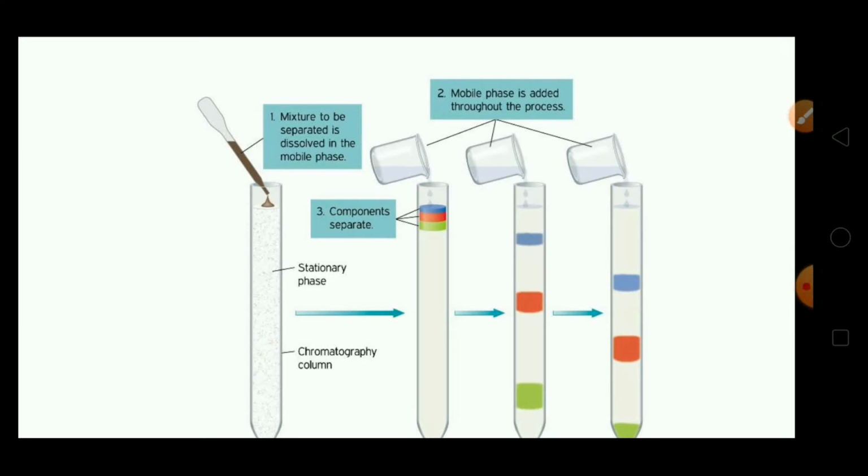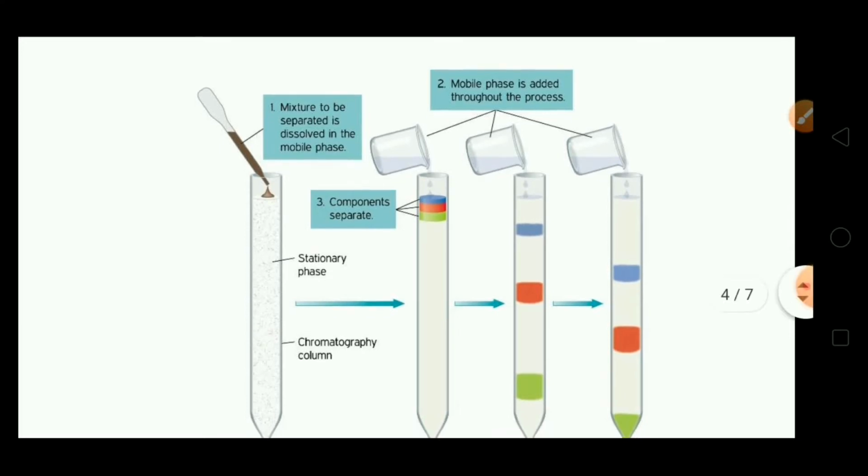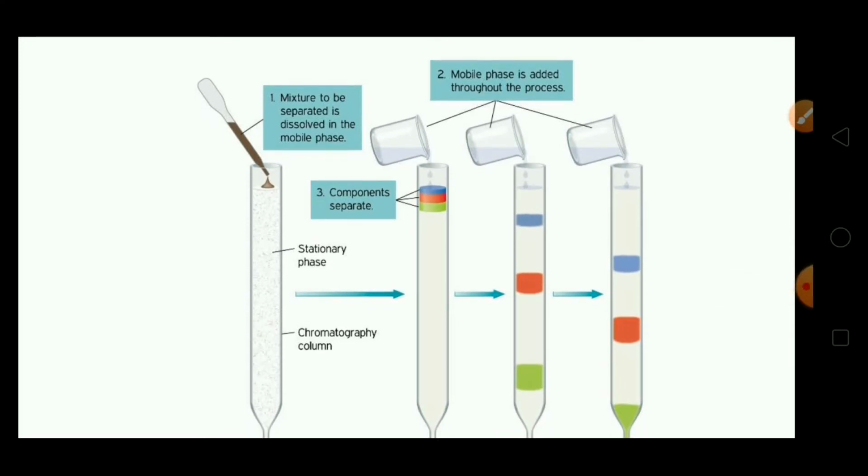You can see step first. The mixture to be separated is dissolved in the mobile phase.